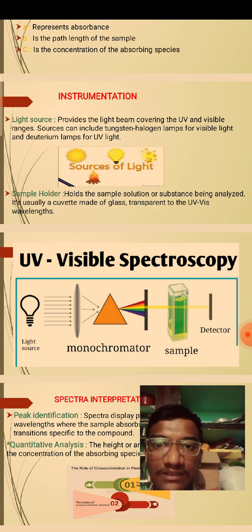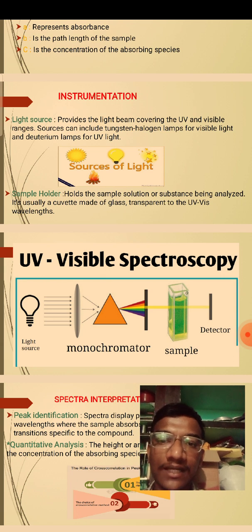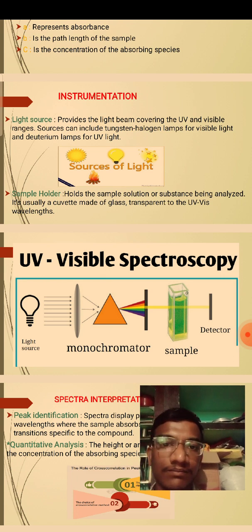And now we can see the sample holder. The sample holder holds the sample solution or substance being analyzed. It's usually a cuvette made of glass, transparent to the UV visible wavelengths.